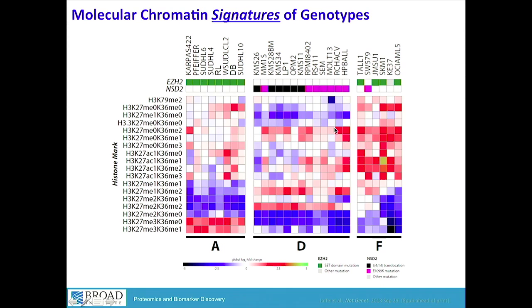And then you can see here in cluster F, it has sort of a very different signature. Different analytes go up, different analytes go down. And so this cluster F has its own signature. And then cluster D, this middle cluster, also has a unique signature.